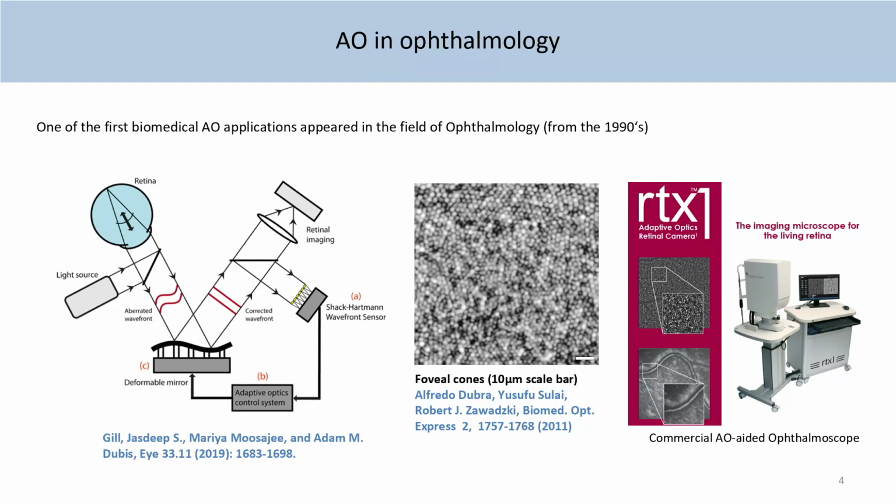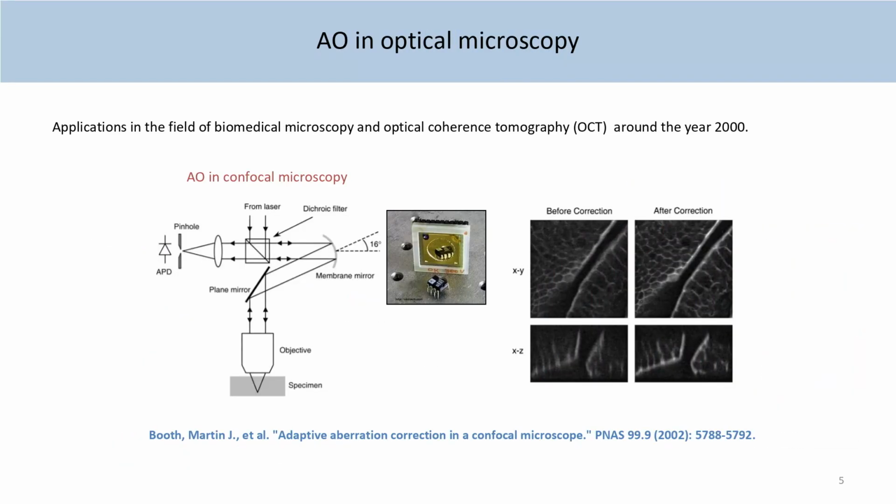Now, for biomedical imaging in ophthalmology, AO is, I think, most developed, largely because they share the same tools as the astronomers. They have direct wavefront sensors and kind of the same feedback loop. You can buy actually commercial AO systems for ophthalmology.